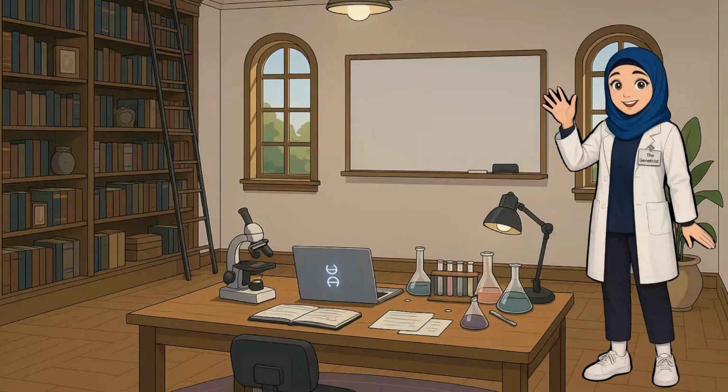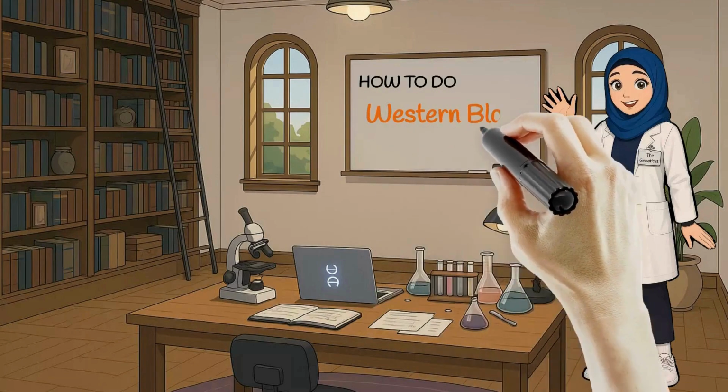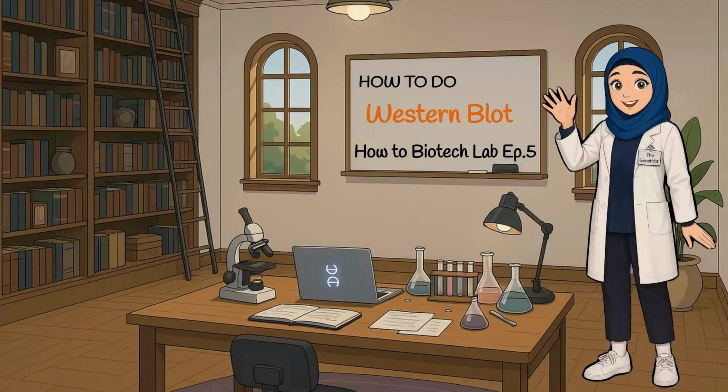In our last episode of How to Biotech Laboratory, we met the Blotting family. Now, as promised, we're doing a deep dive into the most famous and widely used member, the Western blot. Today, we're going on the bench for a comprehensive step-by-step guide, covering everything from core protocols to advanced optimizations and troubleshooting.